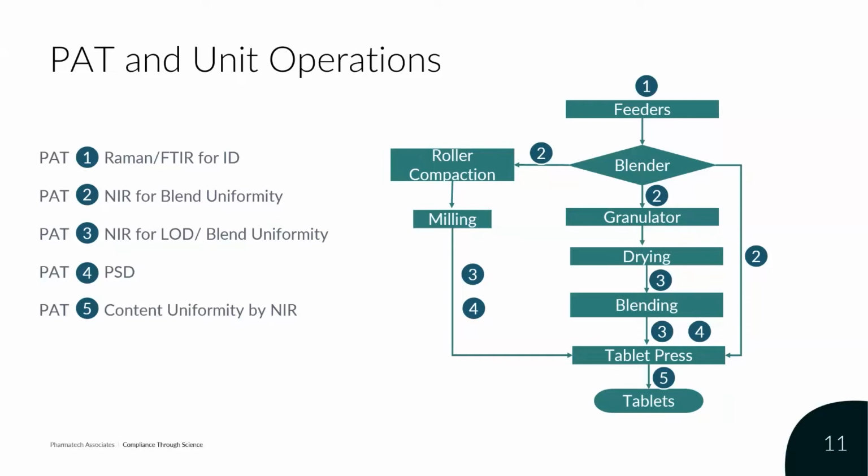And then, of course, likewise for roller compaction and other dry granulation processes, ribbon thickness is often critical. And pharmaceutical scientists have been making really good progress in developing non-destructive technologies to capture this data during the processing, that is on the fly, if you will.